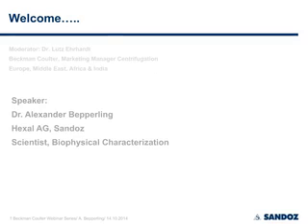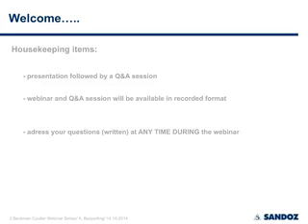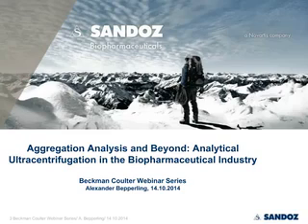Okay, thank you, Lutz, very much for the kind introduction and for giving me an idea about the audience today with the poll. Today I will mainly focus on the data analysis tools to achieve high precision when analyzing biopharmaceutical products, because we are mainly interested in minor species of about 1 to 2%, usually comprising of the total protein content.